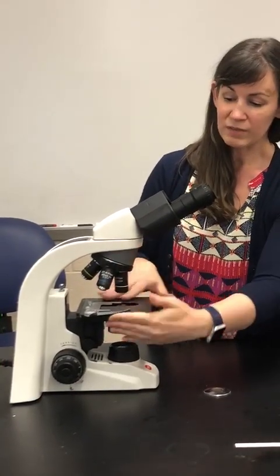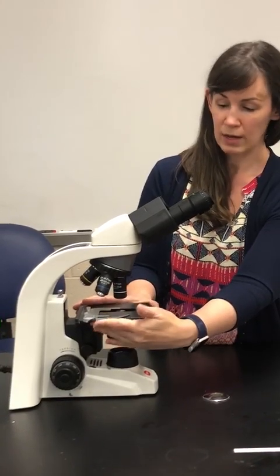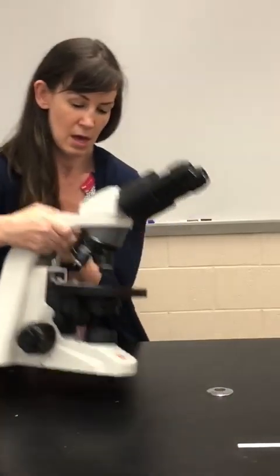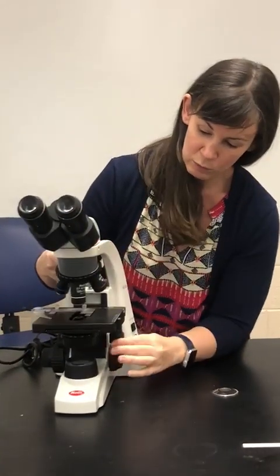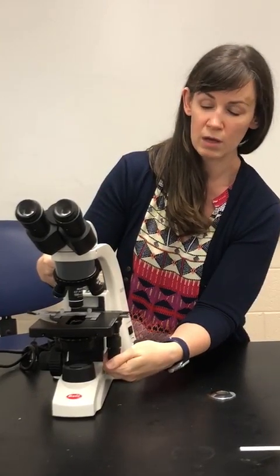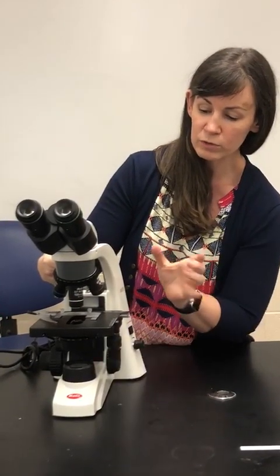Below your objectives, we have the stage. This is where you actually put your slide. There is a stage clip, which can help hold your slide in place. And then there is a knob that allows you to move that clip around and move the stage around so that you can move and see different parts of your slide, of your specimen.